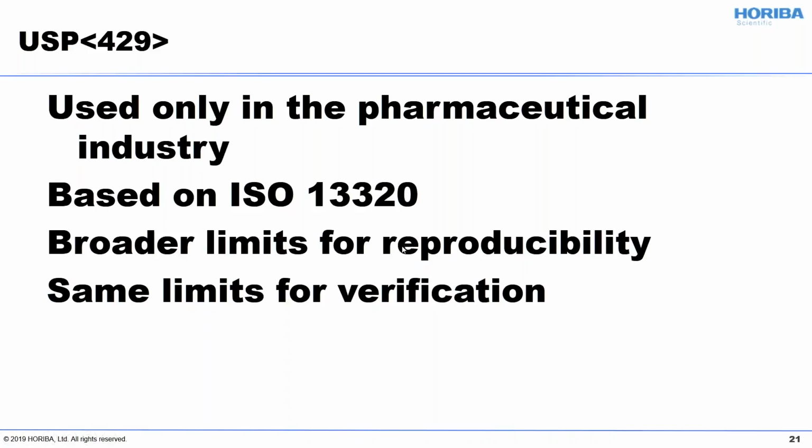Okay, I just had a question: what if the measured result does not fall within the upper and lower limit? I'm going to go ahead and talk about this. If the measurement result doesn't fall within the upper and lower limits, there are three things it could be. The first is you made a calculation error on the upper and lower limit. That's the least common. The most common is that there was a procedural error in your measurement.